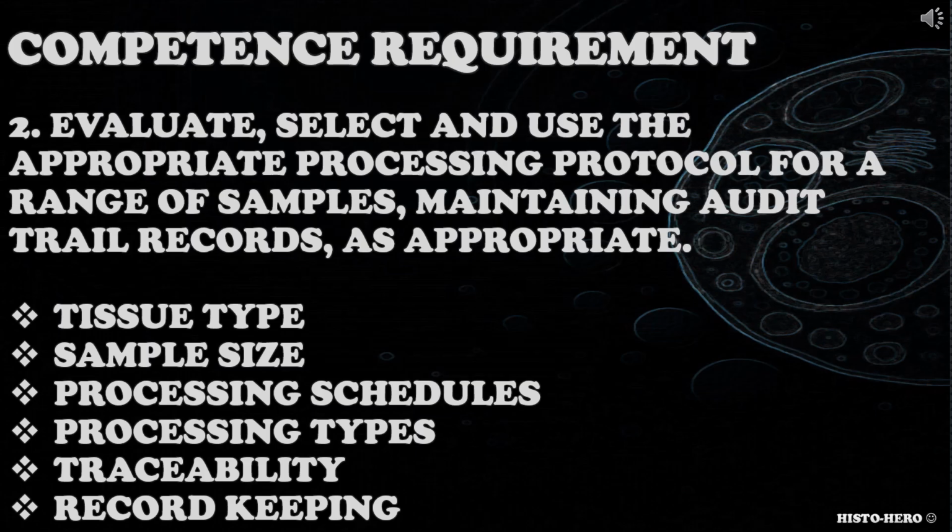Do they know why there are multiple processing schedules? Do they know when to use each of them? Do they know what could happen if tissue was processed using incorrect processing schedule, and why? Do they know how to resolve processing issues? Do they know how to maintain audit trail records for processing?